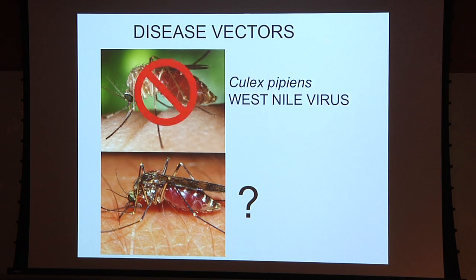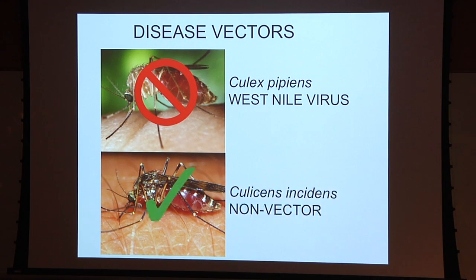This is Culex pipiens, a West Nile virus vector, and this one's actually a different genus, is not. Now, a mosquito expert can tell those apart, but there aren't that many mosquito experts, and they can only sort out specimens a little bit at a time. But you can imagine you can automate this.